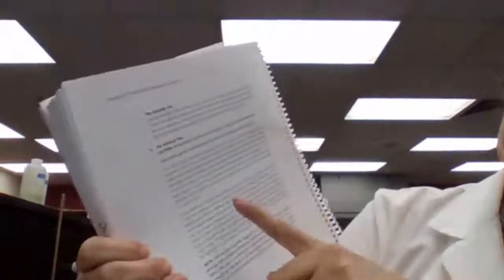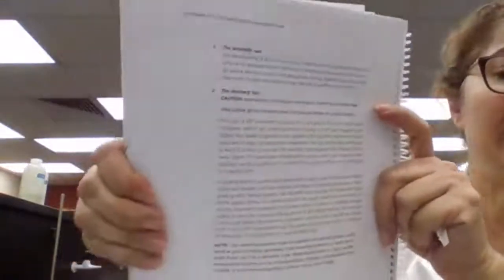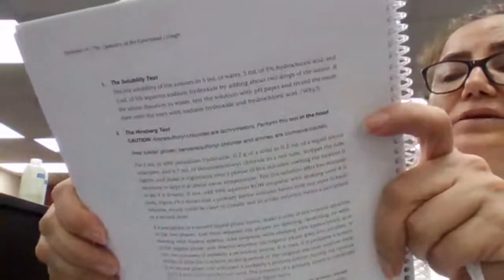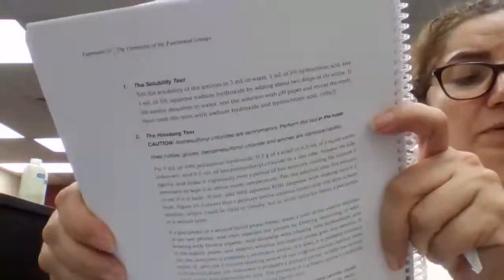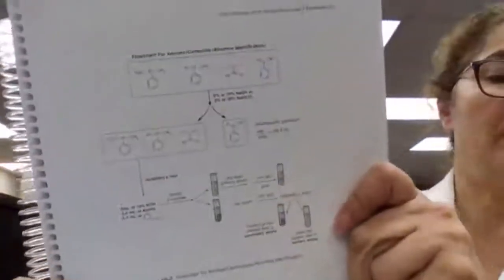On page 218 in the hard copy, you have the Hinsberg test. Based on the reagent that you're adding for the Hinsberg test, you can see if you have primary, secondary, or tertiary amine.